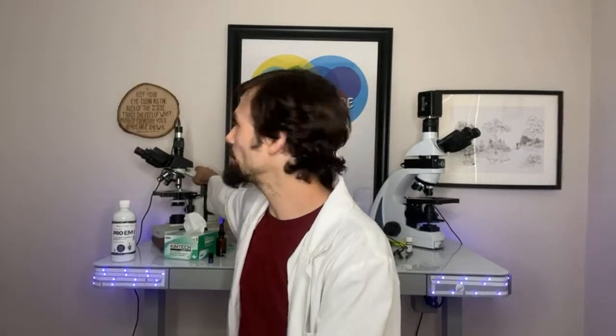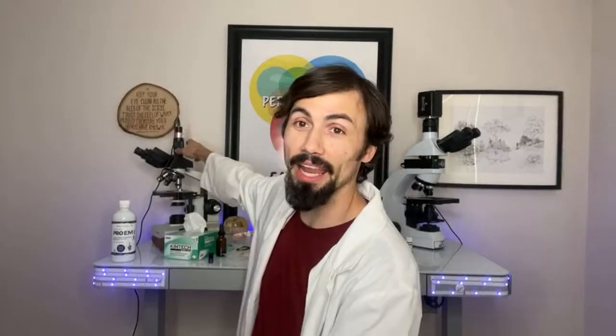This is a camera here, just about 75 dollars. You can hook up a Nikon camera via a T-mount, and you can get one for almost every single DSLR camera — Nikon, Canon, some Sony options. People are putting awesome cameras on top of these microscopes and getting incredible images. Once you get your eyes off the eyepieces and feed a camera out onto a nice monitor, you're really in business.